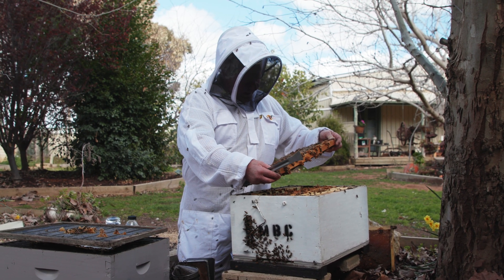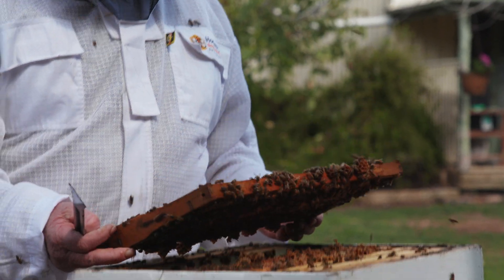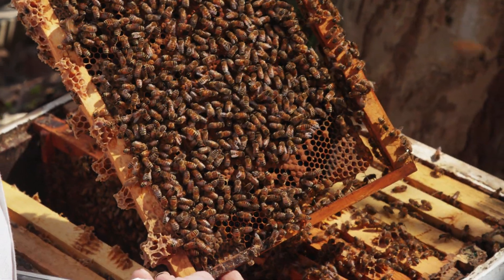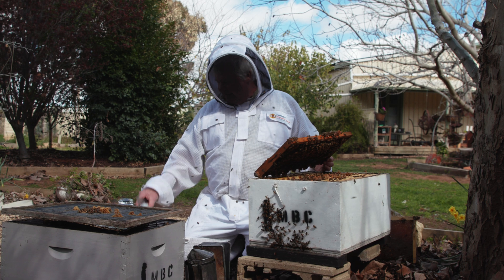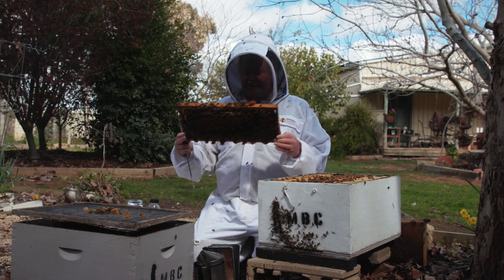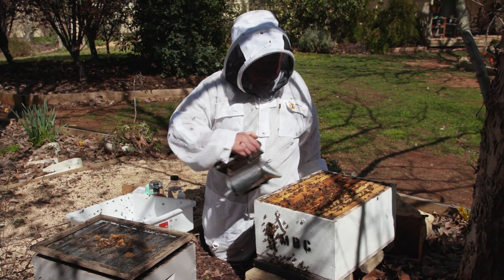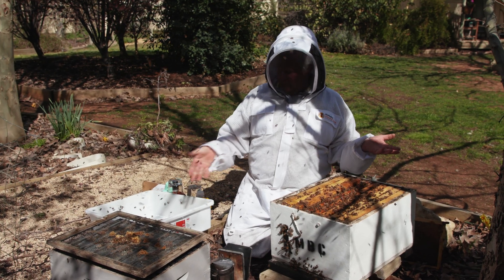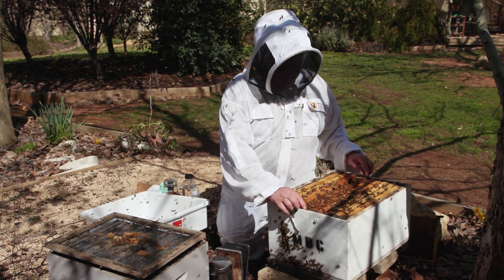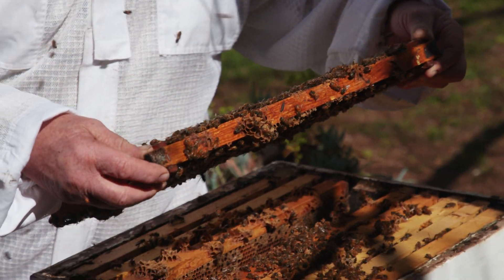We've got a nice little bit of capped brood and some nice little white larvae. Now we just wanna give that a shake. The good thing about shaking them into another container like that is you're actually going to get rid of most of your field bees. So you're gonna have an even higher concentration of nurse bees — a double whammy: you get to double check for the queen and also get rid of most of your field bees, leaving only nurse bees.